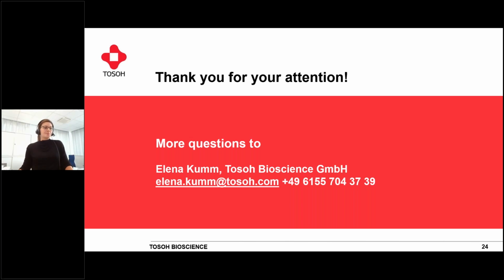So, are there general recommendations according to pH for the buffer and the PI of the protein as a starting point for method development? Yeah, it's a tricky question.